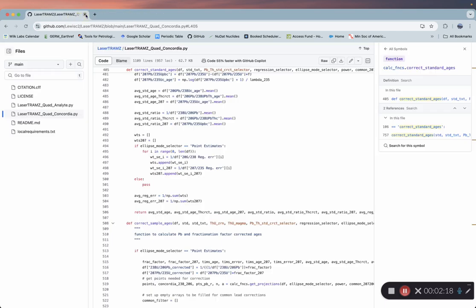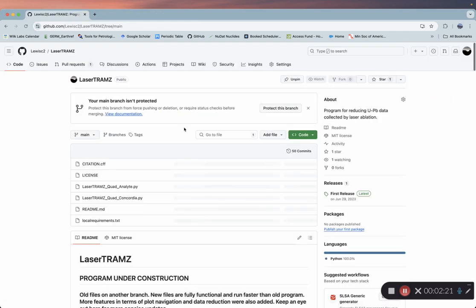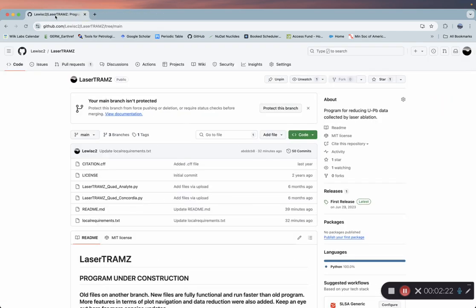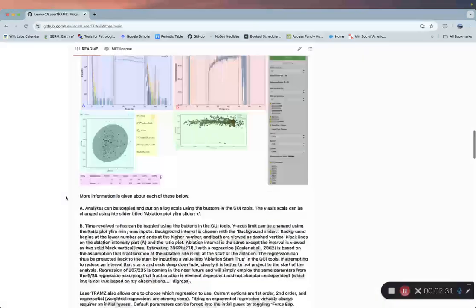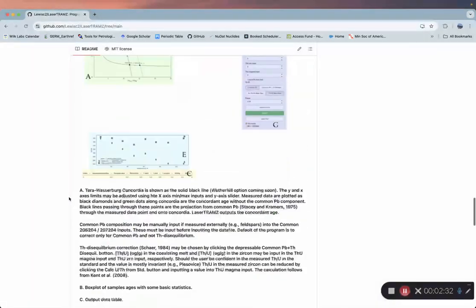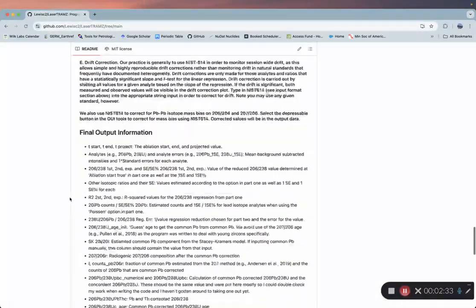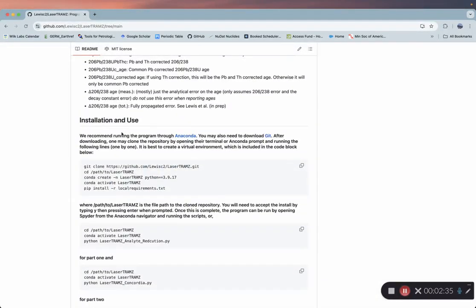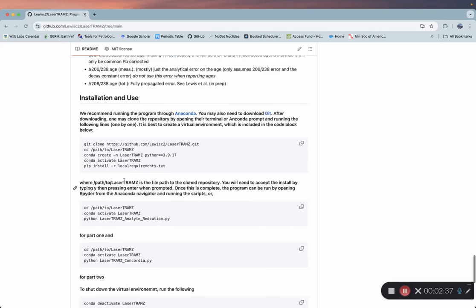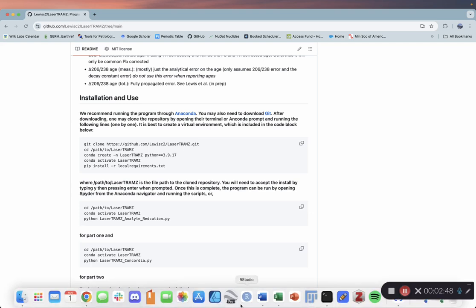Once we have that done, we can go to my GitHub page, just look for Louis C2 LaserTramZ, or type in this address. If we come down here to installation and use, we see that we have this block here, and basically we're going to go one by one, line by line, and install LaserTramZ.